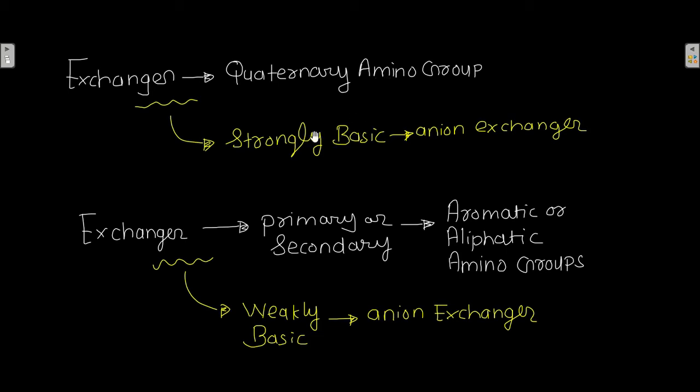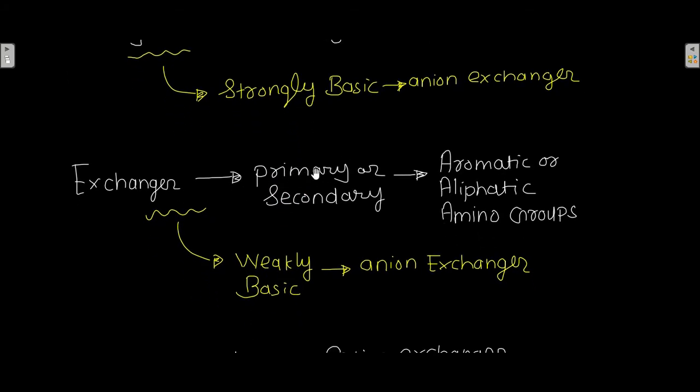Consider this. If an exchanger has primary or secondary aromatic or aliphatic amino groups as the functional group, then that exchanger will be a weakly basic anion exchanger.